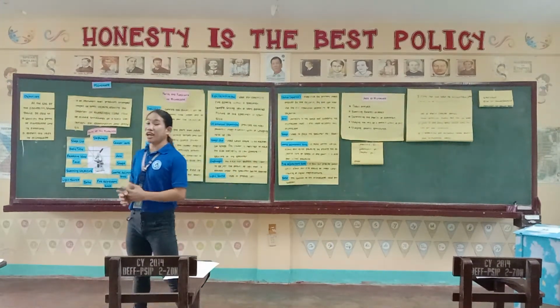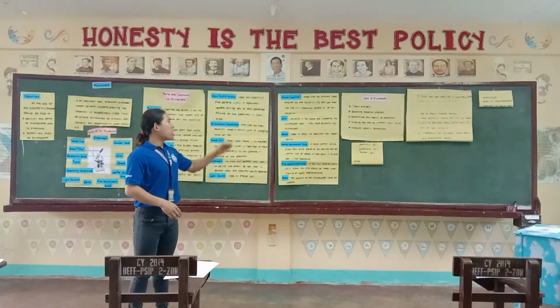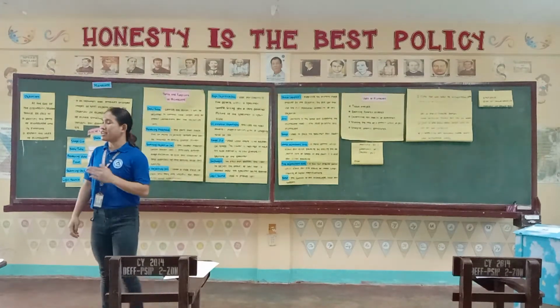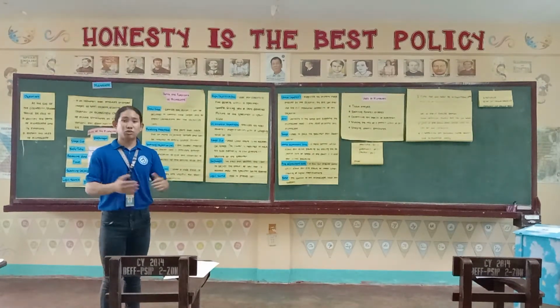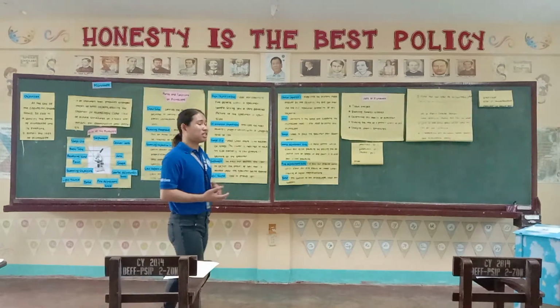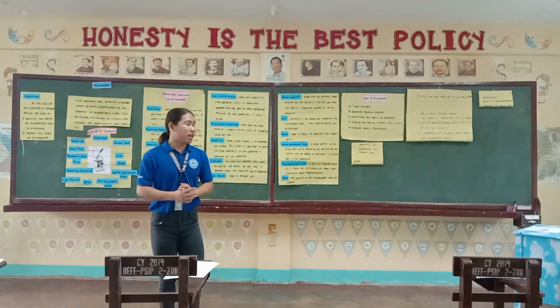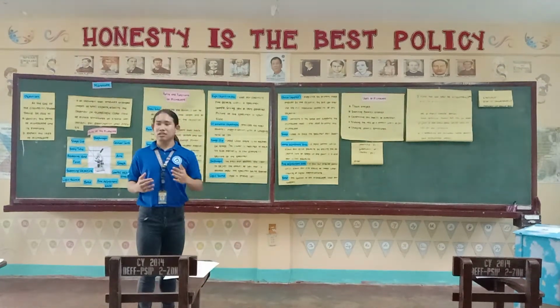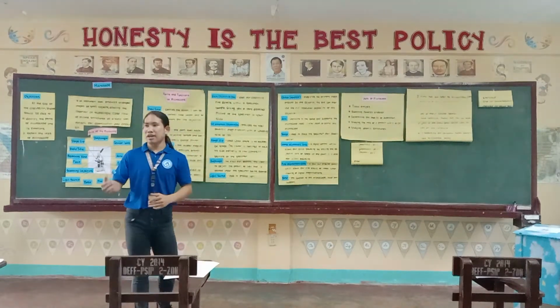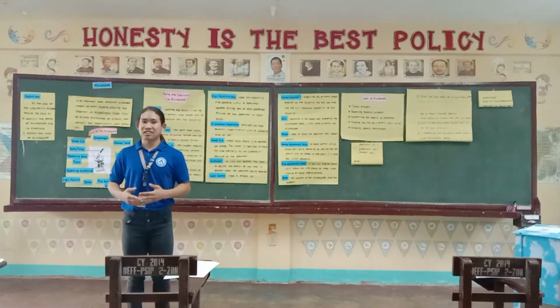So be able for us to clearly understand the function and structure of a certain organism, we have to use the microscope. Especially now, facing the COVID-19 pandemic, as we all know that viruses and bacteria are very small and we can't even see them. So be able to study its function, its whole parts, we use the microscope, be able for us to determine the strength of a virus and its weaknesses, right?